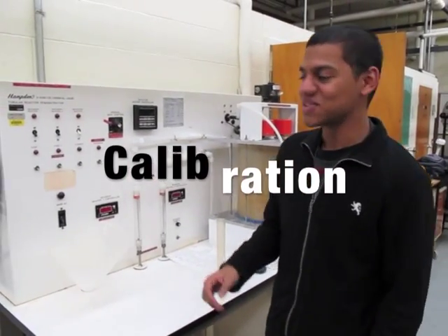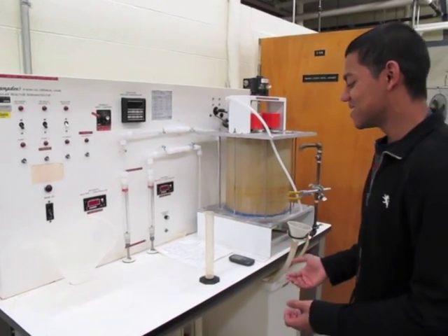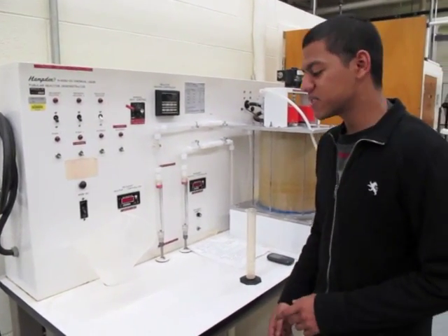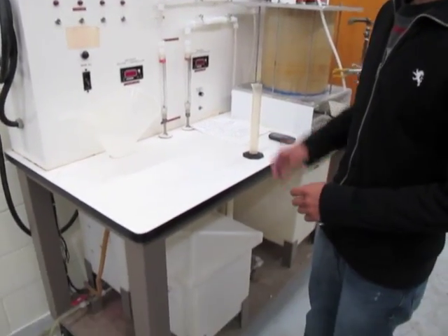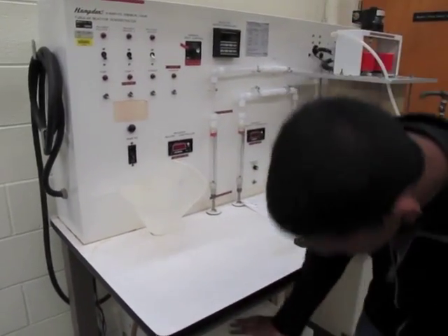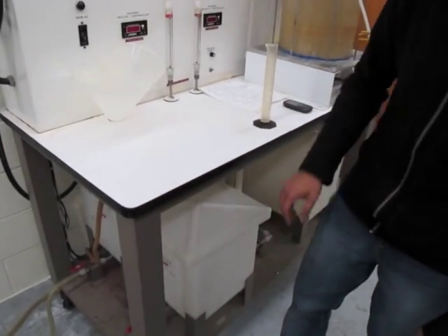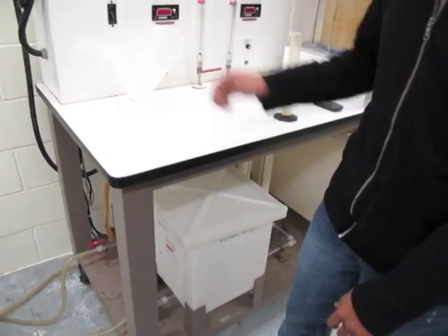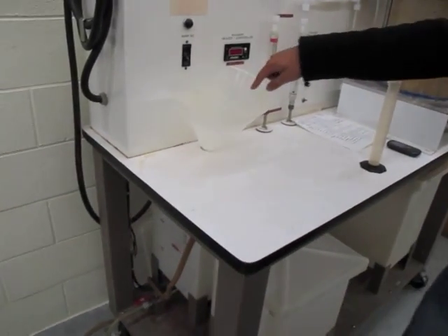This is the PFTR. First, what you want to do is calibration. We're going to use water to calibrate the pumps. You fill these two tanks down here with water. You fill this one right here by lifting the lid, and you fill the one in the back through this funnel.